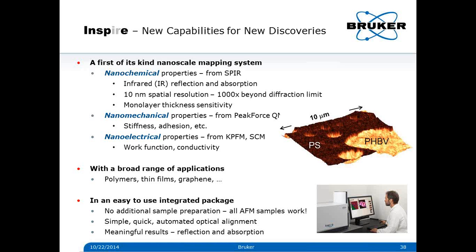Regarding KPFM, do you have a recommendation for surface preparation? Also a question, were these measurements done in vacuum for the KPFM? Well, for KPFM, we didn't do anything in vacuum here, so it was normal AFM, KPFM mode.